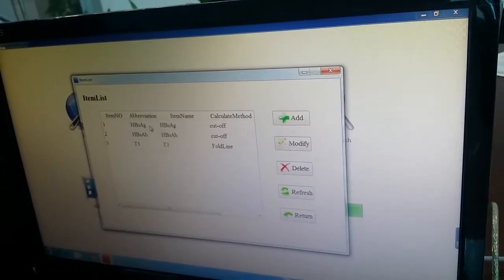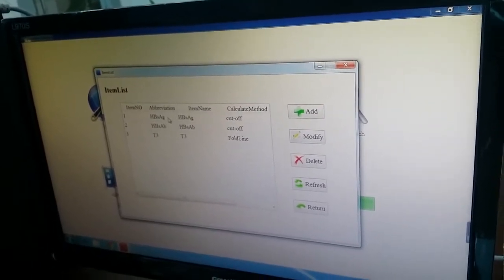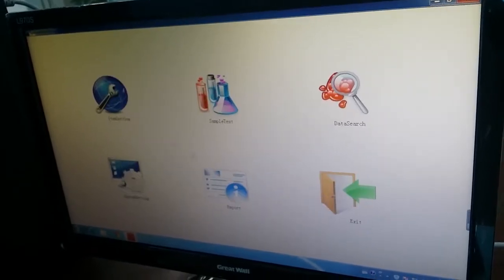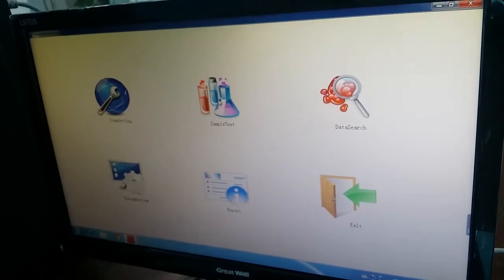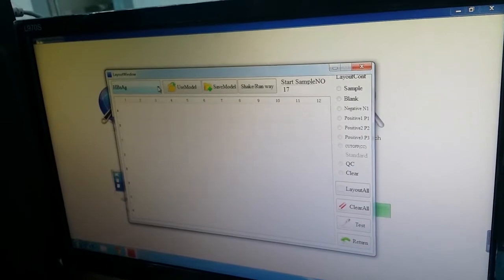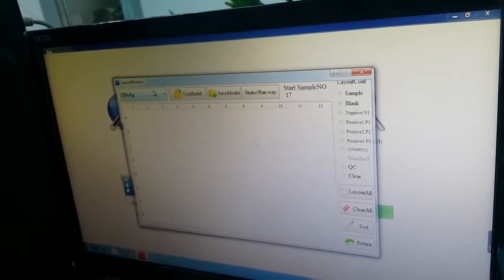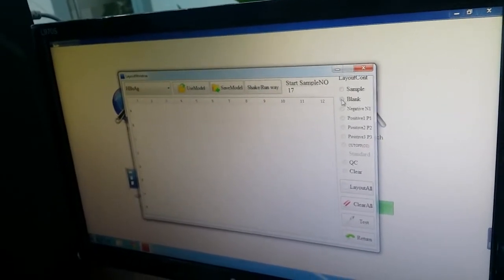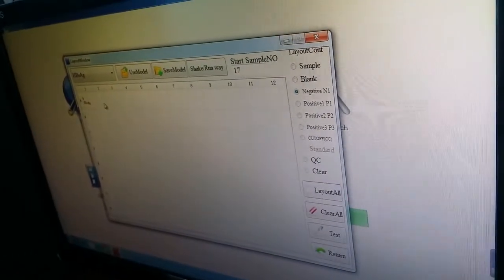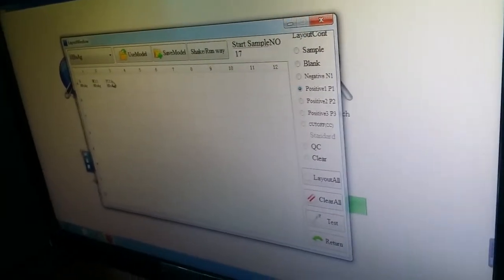Now this item for the qualitative test has been configured. Let me show you how to run a test. Press Return, then go to Sample Test. From the left panel, choose the item name you want to test. Press it, and from here choose the blank, the negative, and the positive positions according to the reading specification.